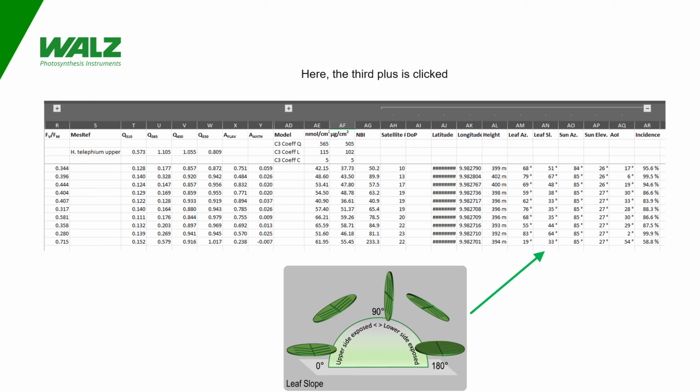And finally, clicking the third plus, columns with data related to the calculation of the angle of incidence are made visible. This makes the column leaf slope visible, which gives the angle between the leaf and the earth. Measuring the top side of the leaf, this gives values between 0 and 90 degrees. If the instrument is turned around to measure the bottom side of the leaf, it gives values between 90 and 180 degrees.